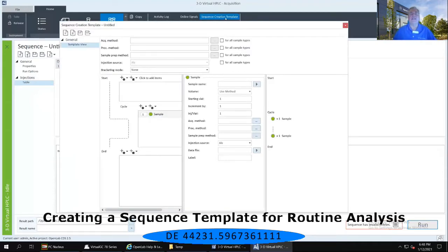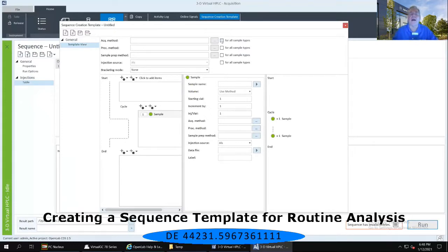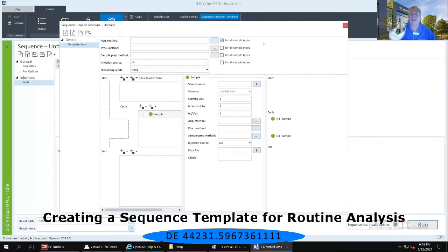The first thing I need to do is assign an acquisition method to this sequence template. In order to do that, I need to select the checkbox immediately to the left of 'for all sample types' for the acquisition method. Click on that checkbox — it puts in a checkmark for all sample types and immediately opens up three dots to the left of that checkmark.